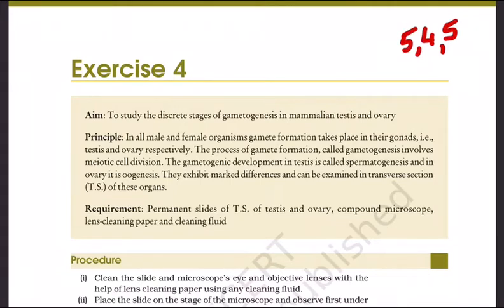of the transverse section. And now comes the fourth question, which is very important, and it is related to theory also. That is for 7 marks. In this 7 mark question number 4, we give you some specimens and we put some slides under the microscope. What you need to do is, first, identification. Point number 1 is you should identify the name of the specimen that is displayed, that is kept in front of you. Second, classify that animal or plant. Classification you have to write.